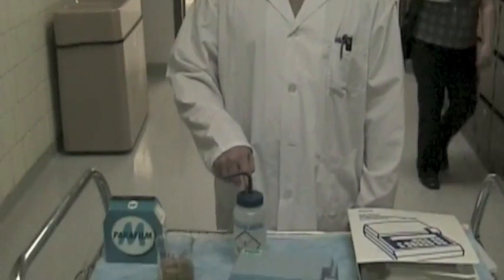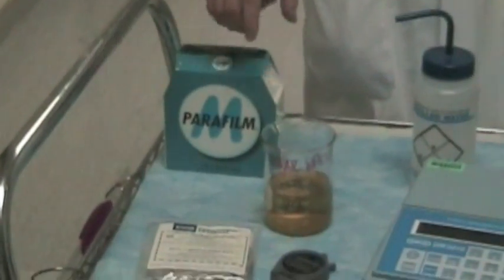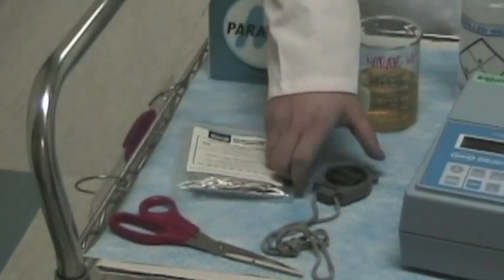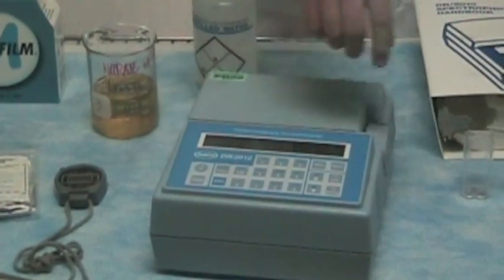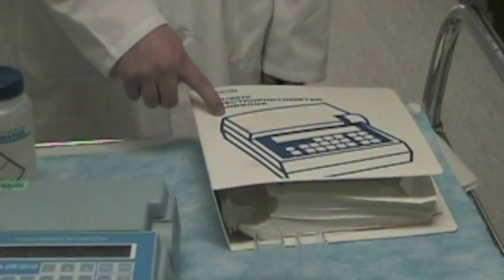We have the distilled water, parafilm, a waste jar, the 25 milliliter nitrate reagent powder, a timer, the HACH DR 2010 spectrophotometer, cuvettes, and the handbook for the spectrophotometer.